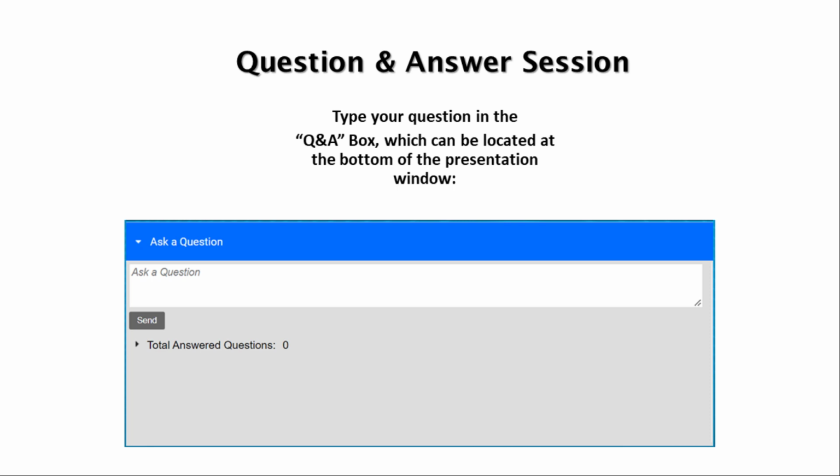And then the length also is going to depend on how much distance there is between the outlet of the column and whatever detector you're using, whether it's UV or mass spec, or if you're going from, say, the outlet of the column to a mass spec diverter valve or into the source. So you would have to measure that length, but don't go longer than that.